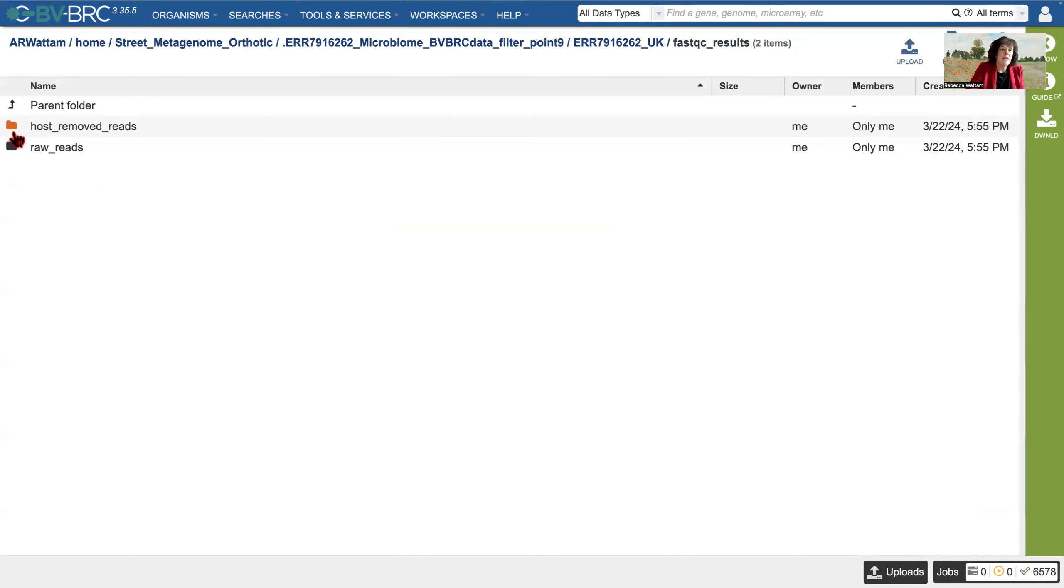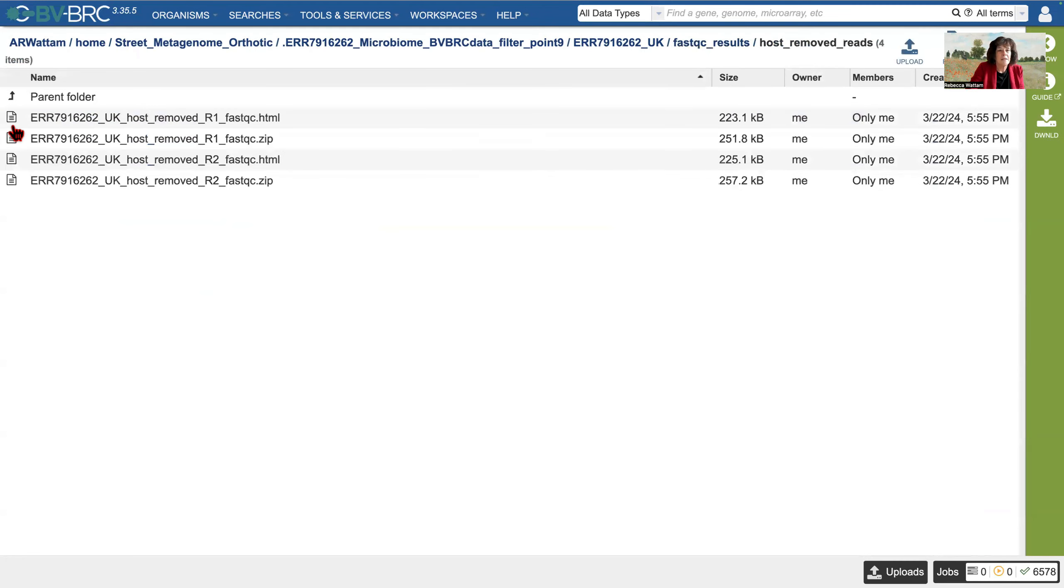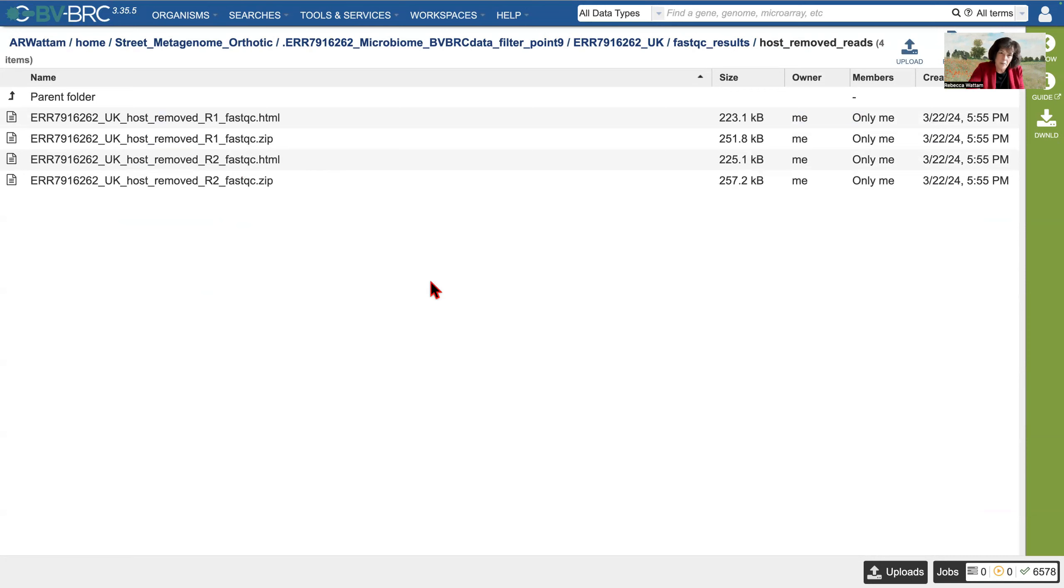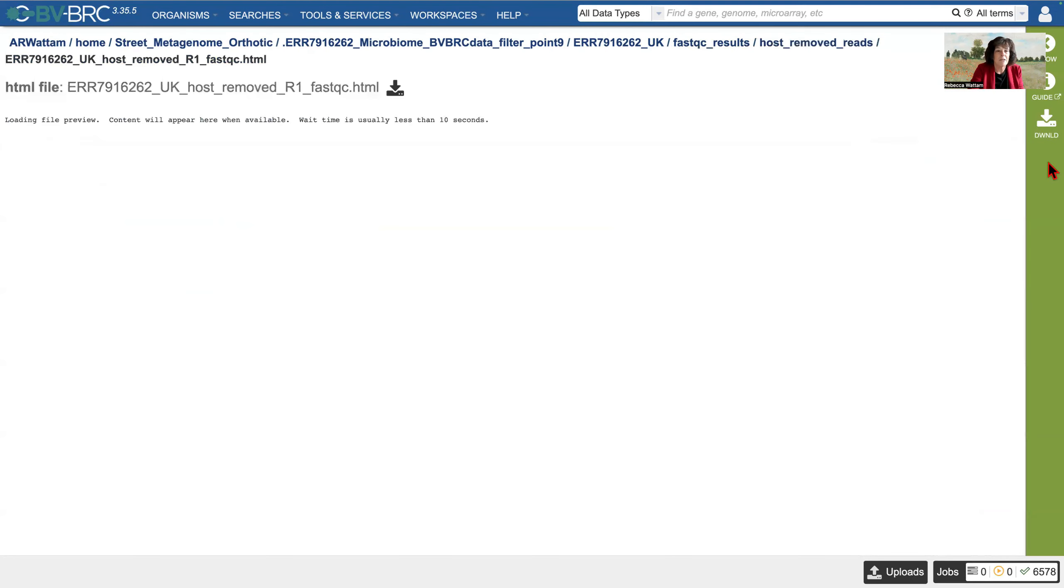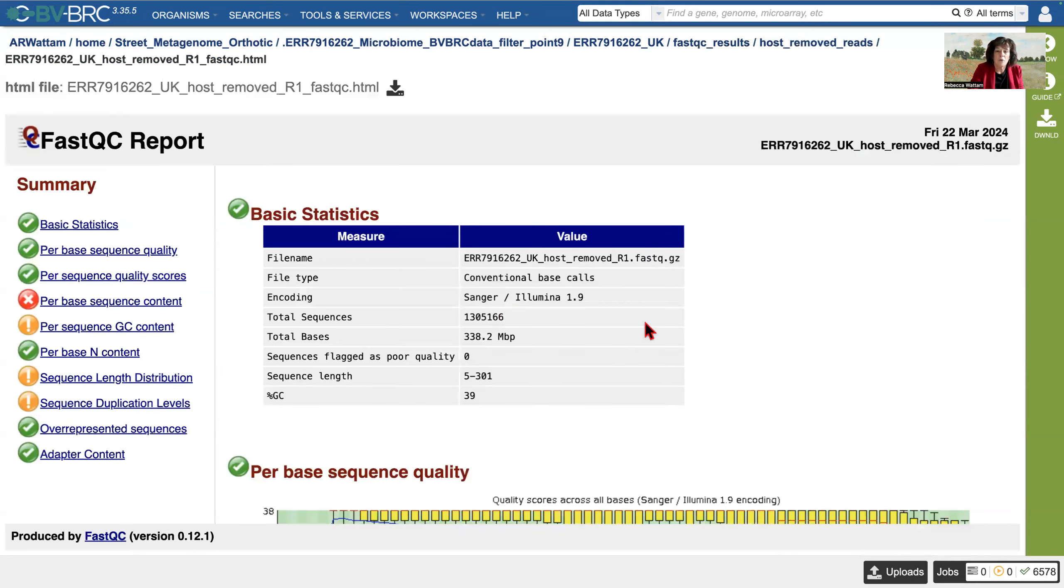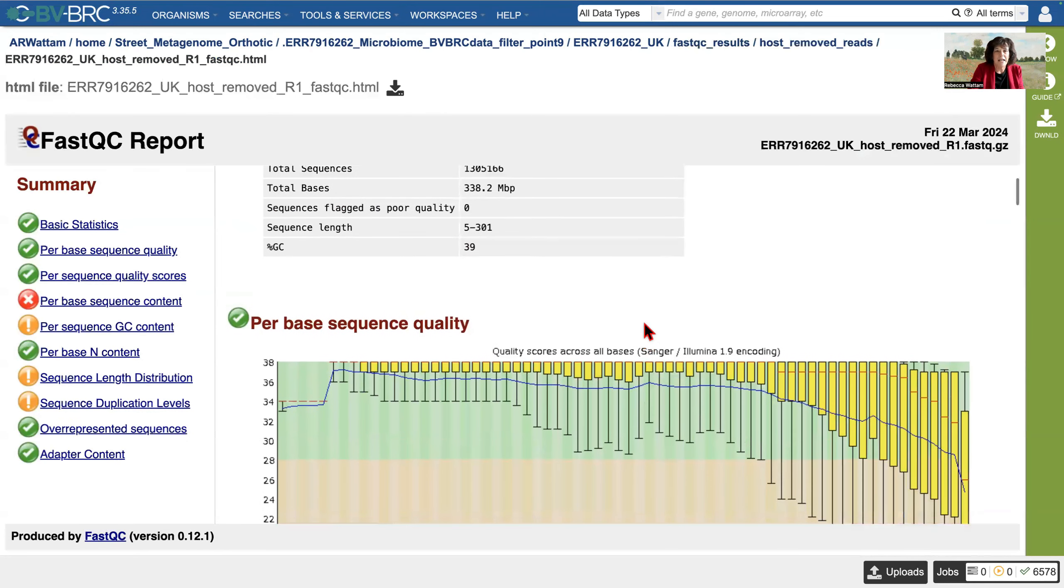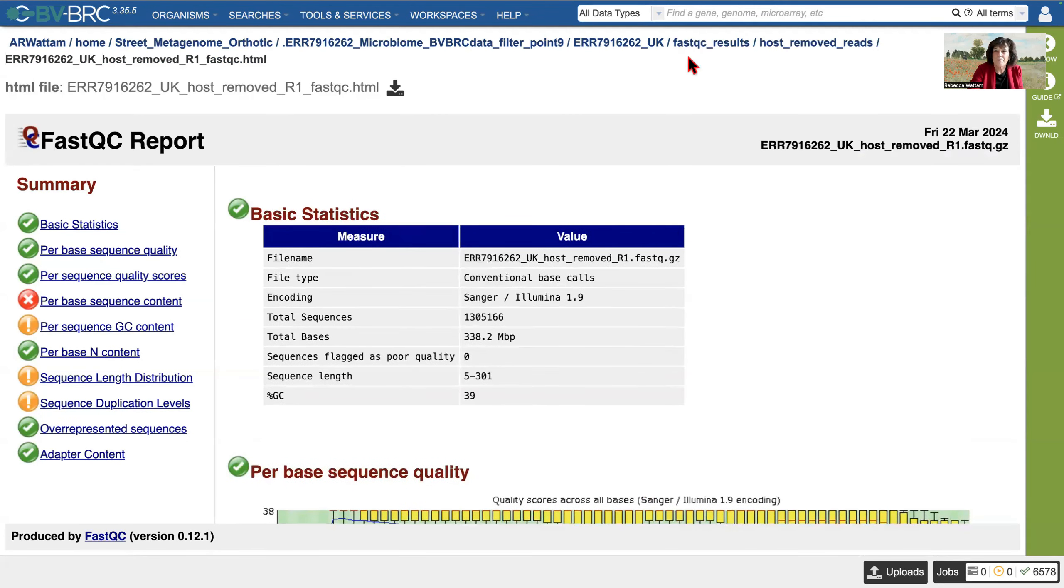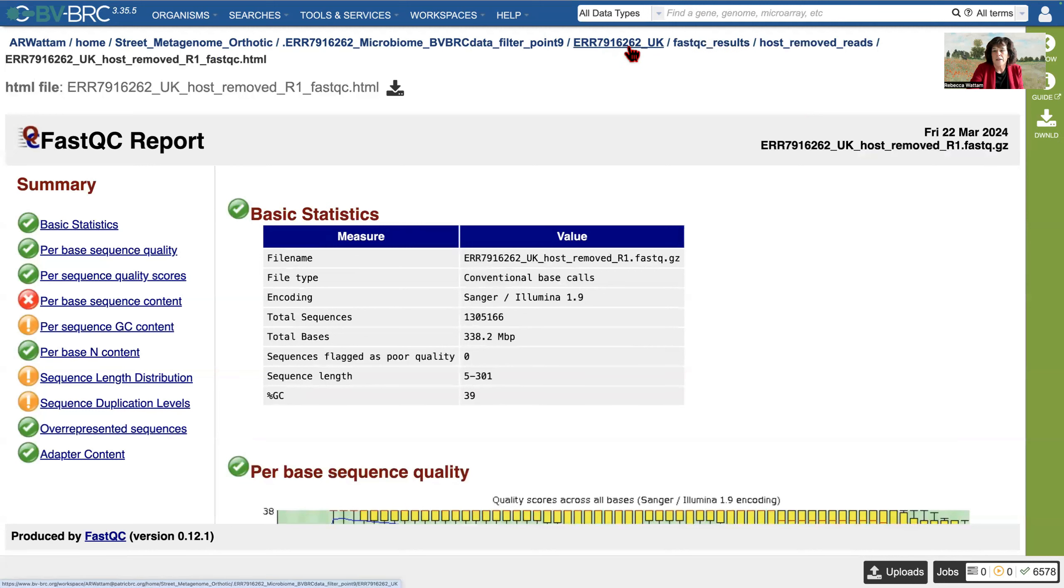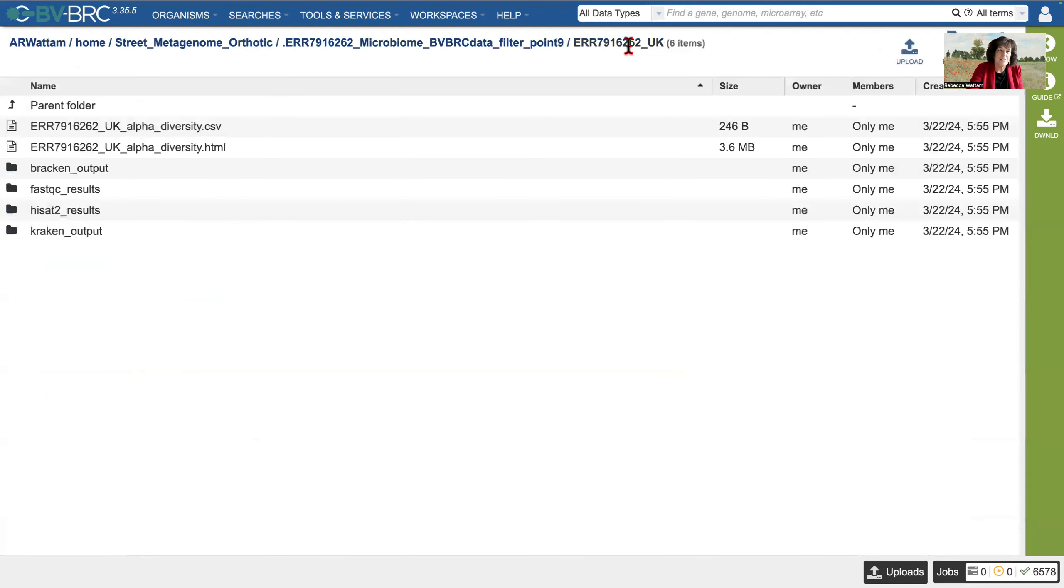And then we have the host removed reads. So let's click on that. And then we have the same thing. So that's the FastQC report for the host removed reads. And if you'll remember, the pipeline does that too. So this is where those reads are found. You would expect them to look the same things. They were all sequenced at the same time. We can look at it briefly. And yeah, no surprises there.